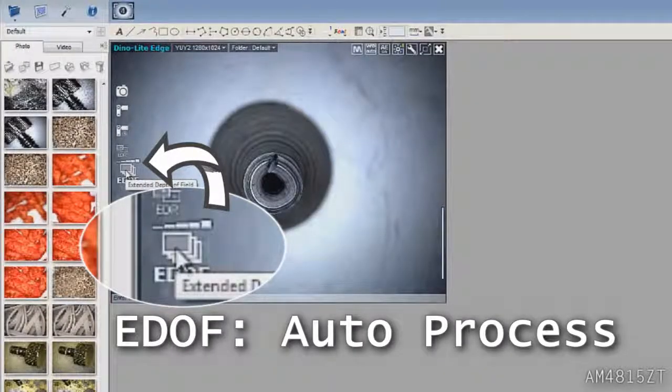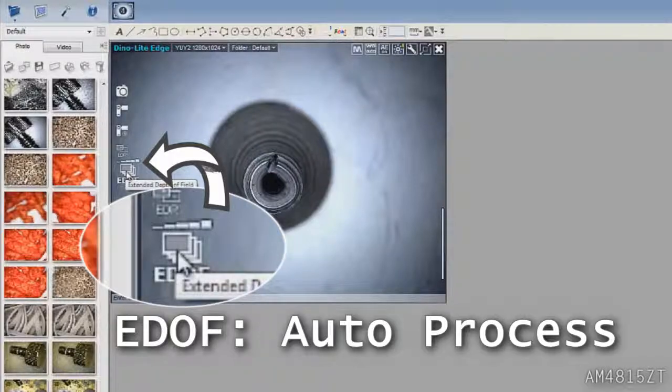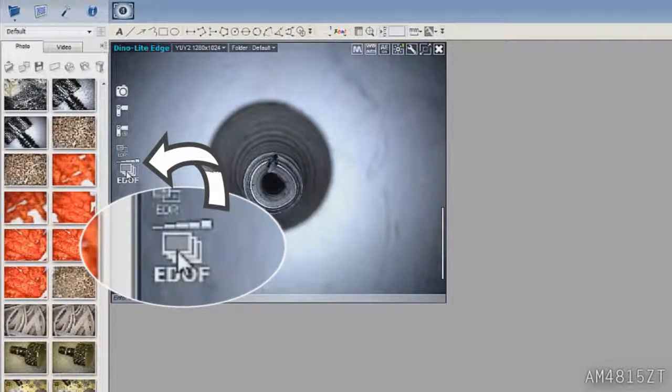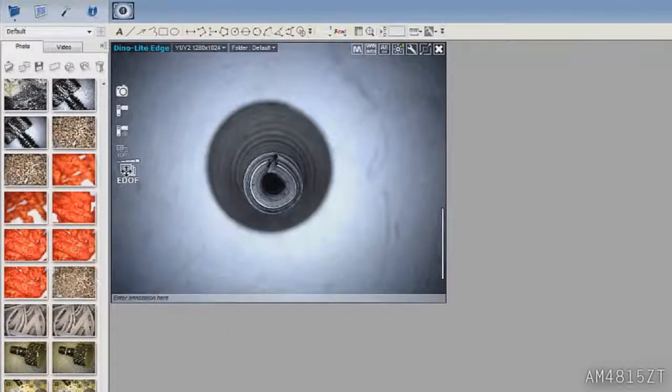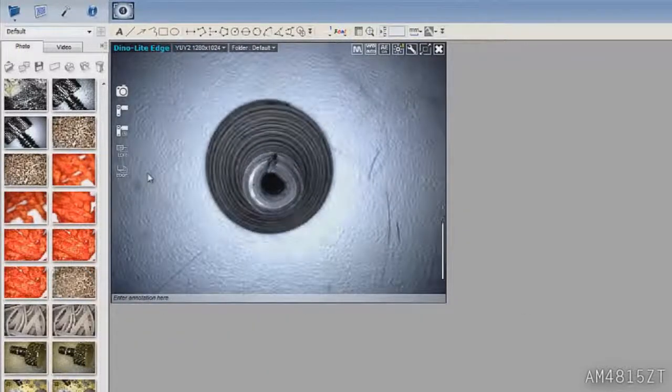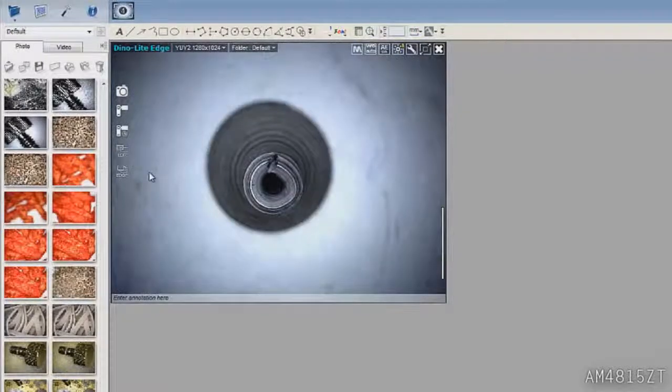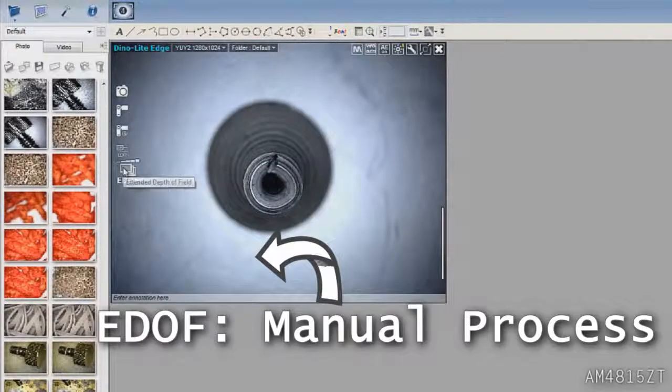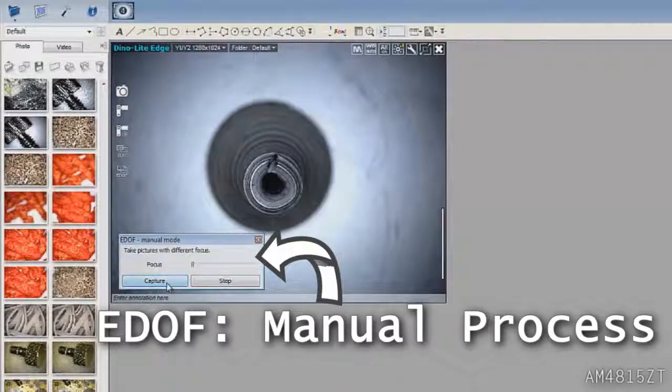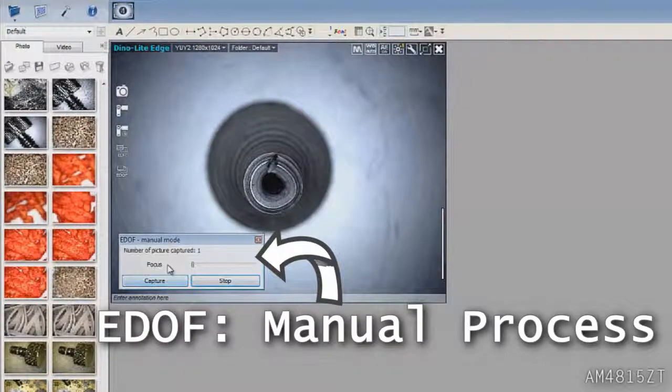For more levels of depth in Auto Mode, hover over the EDOF button and use the mouse scroll to cycle through 3-5 levels of focus and the Manual option.